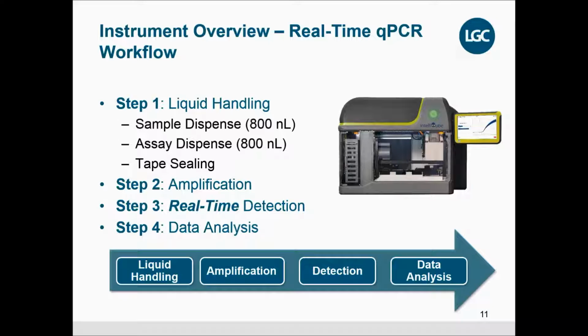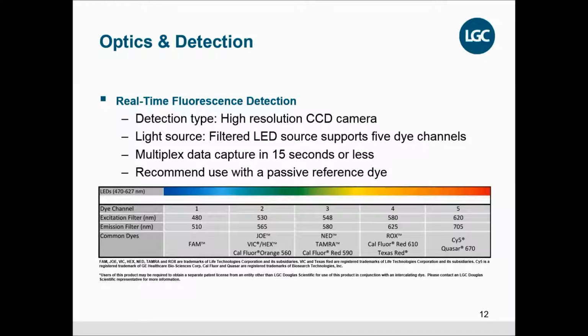Now this is a continuous process, so as soon as one array is finished, it moves out of the machine, the next array is dispensed and ready to go, moves into the thermocycling station, and continues the PCR process.